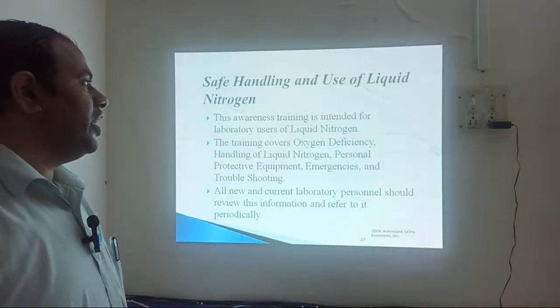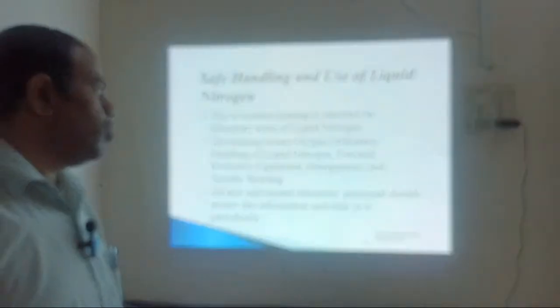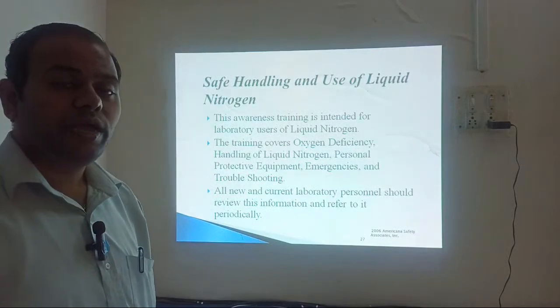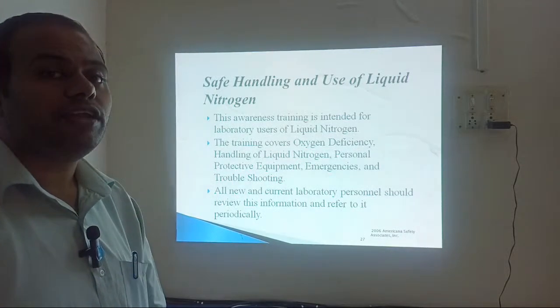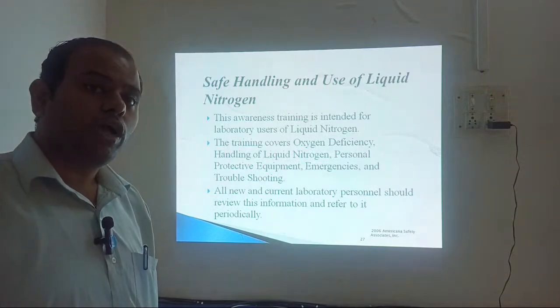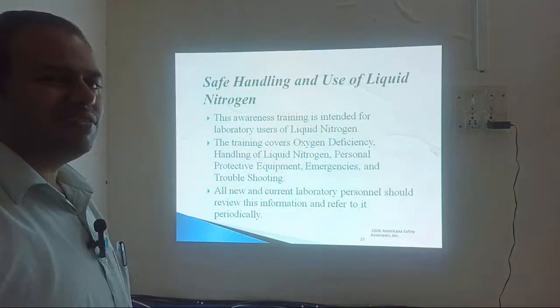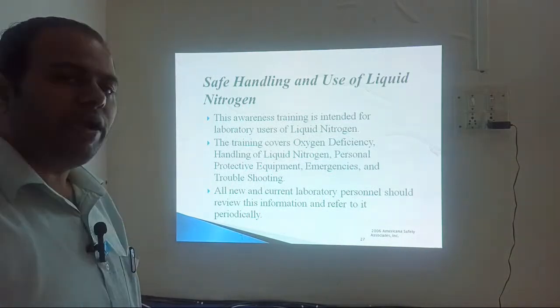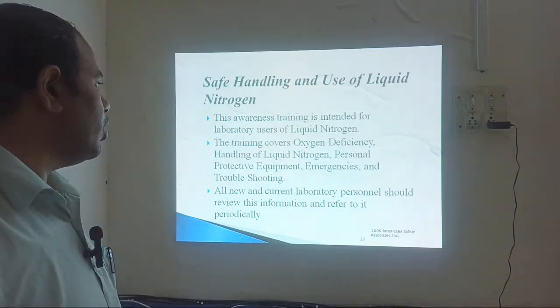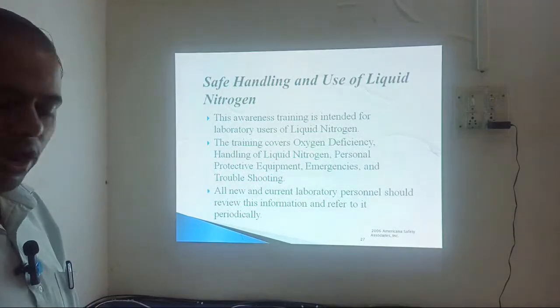The awareness training is intended for the laboratory use of liquid nitrogen. As you know, the temperature of liquid nitrogen is about minus 196 degrees Celsius. The liquid nitrogen boils off at minus 196 degrees Celsius. It is at a very low temperature, and it can be dangerous. It can cause frostbite in human beings. So you have to handle liquid nitrogen very carefully, and here we are going to discuss that.